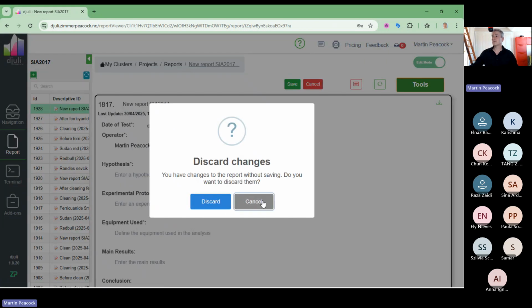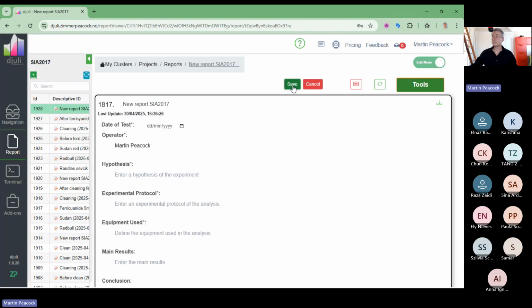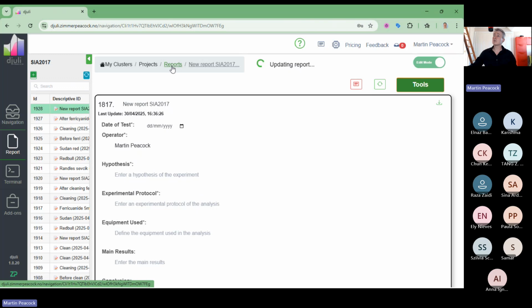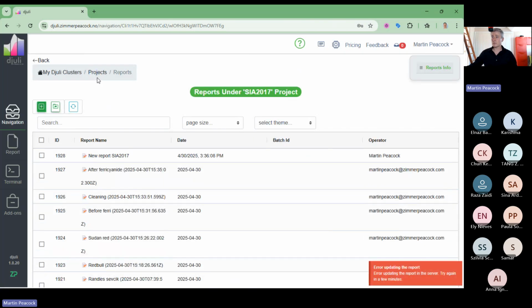Reports, cancel. I'm just going to save that for a second. I just want to save what we did in that particular report. And then I will go here and I will do a refresh here.